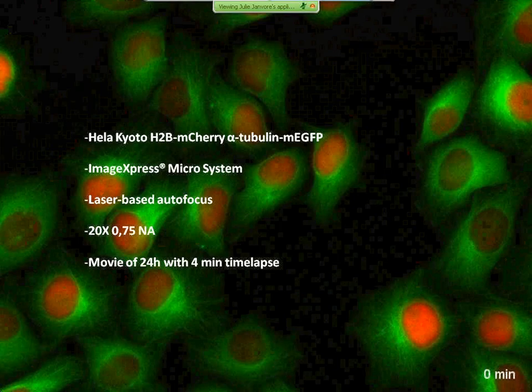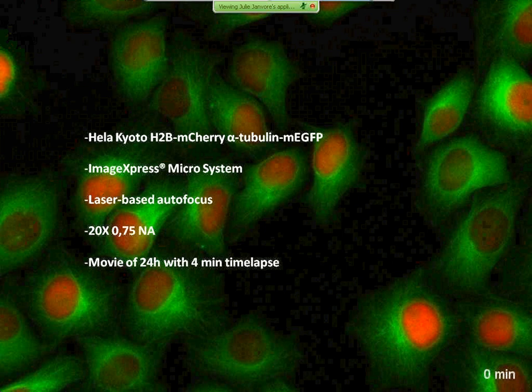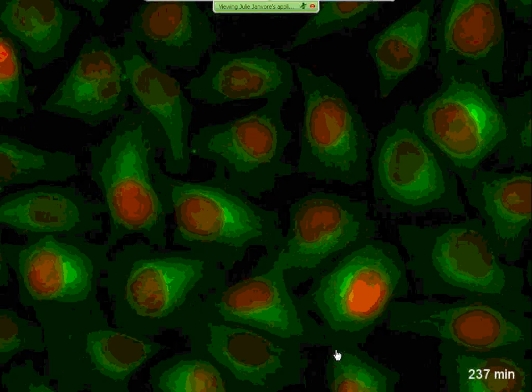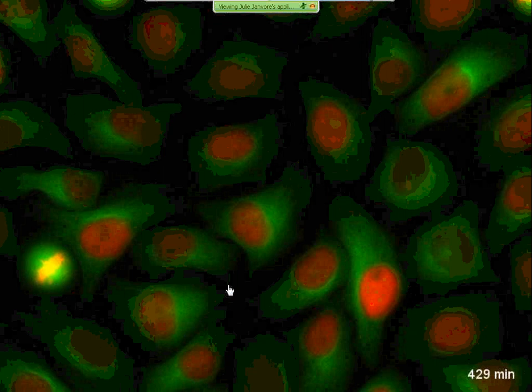Here is an example of the type of movie I'm recording on the ImageExpress Micro system, using this cell line with red DNA and green microtubules. This was performed with a 20x, 0.75 numerical aperture objective using a very robust laser-based autofocus. This is a movie of 24 hours with 4-minute time-lapse intervals. You can see that we can follow the cells, follow the details of microtubules — even sometimes single microtubules — and also follow cell division. You can even see the intercellular bridge between the daughter cells and the severing of the bridge during abscission.